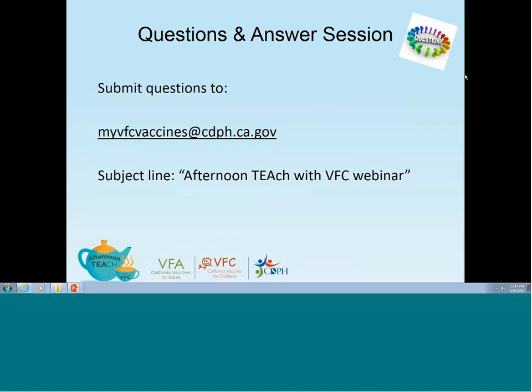That's actually a very convenient feature for your clinic to have when you consider getting your units recalibrated. Might be a good feature to have because you can be anywhere and receive a text, and it will indicate which units are out of range. Or you may be able to log into one portal and be able to see all of your units that may be within temperature or out of temperature. So that is certainly a very nice feature.